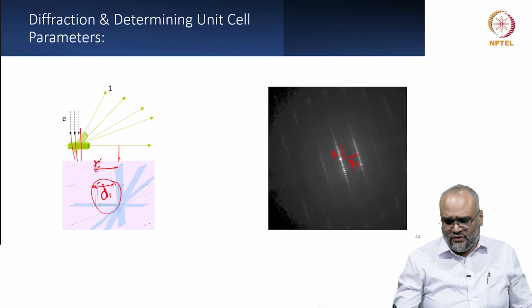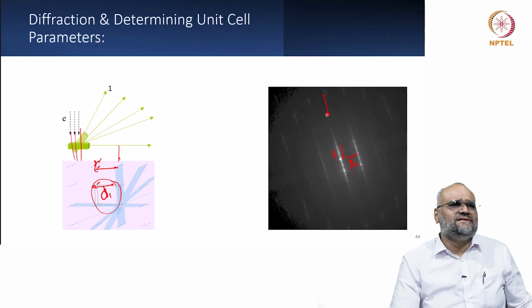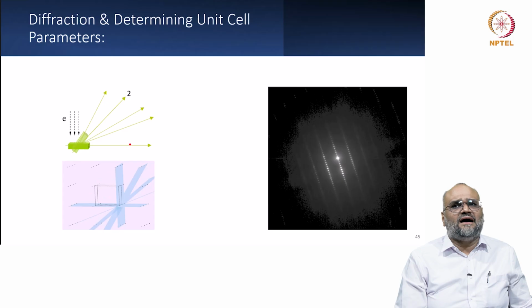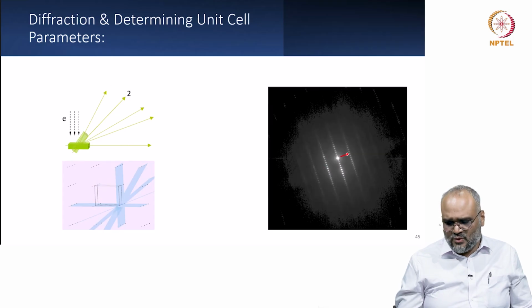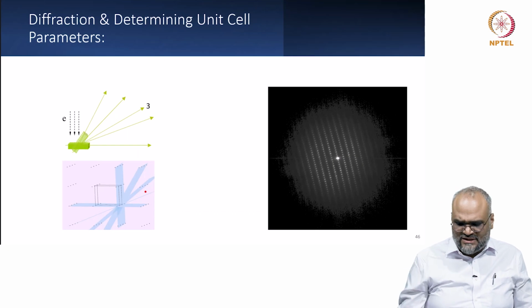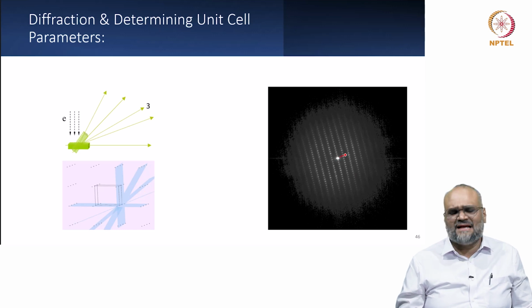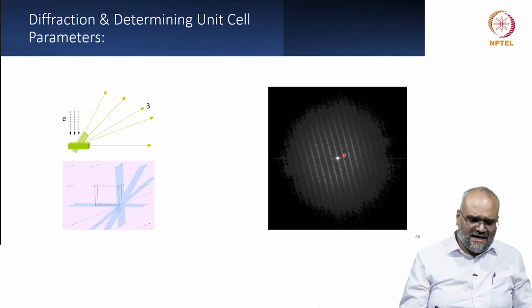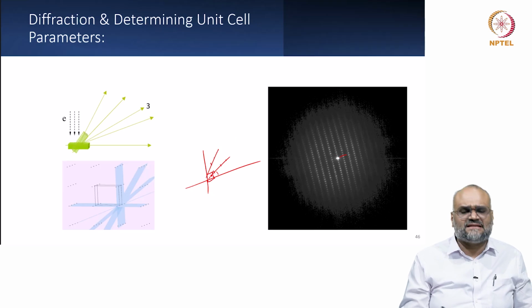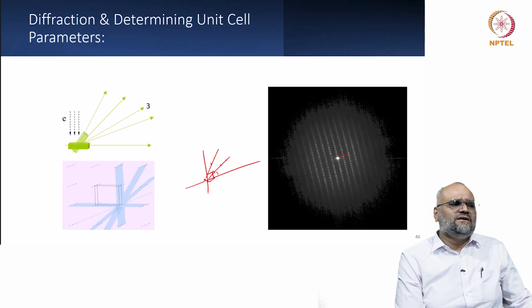If I now use one of the crystallographic axes as constant and I now tilt the specimen in this direction, I obtain the planes with varying G1 and this G2 remains constant, and with these variations, whatever projections I record, I can overlay them over each other and measure them and plot them on a kind of graph paper and see with how much angle of deviation, how these diffraction spots are changing, and I can construct the projection of a reciprocal unit cell.